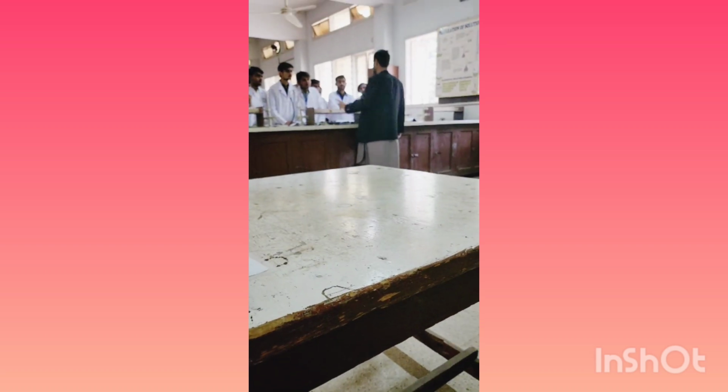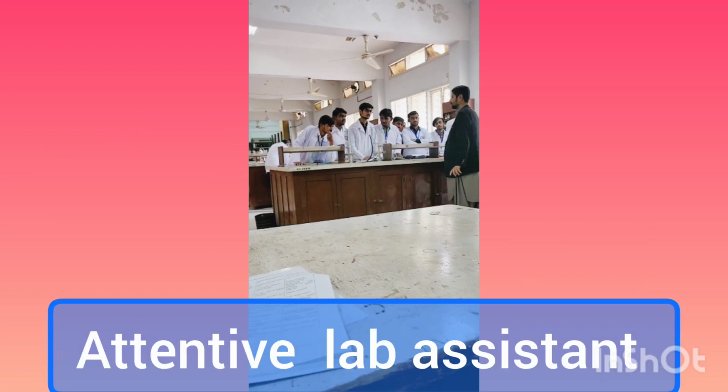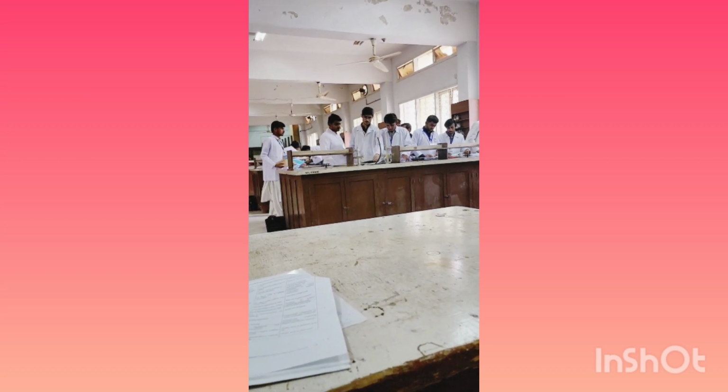My lab assistant, Mr. Irfan, is here, and he's explaining to them that they have to issue the glassware and submit it back to him, and they have to divide themselves into different groups so that they can work.